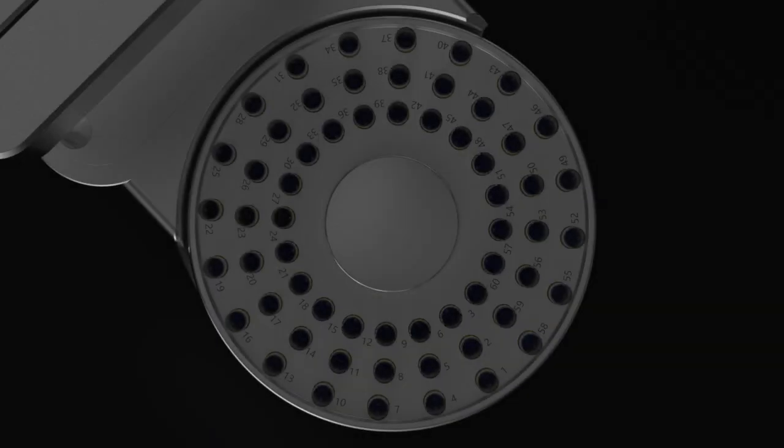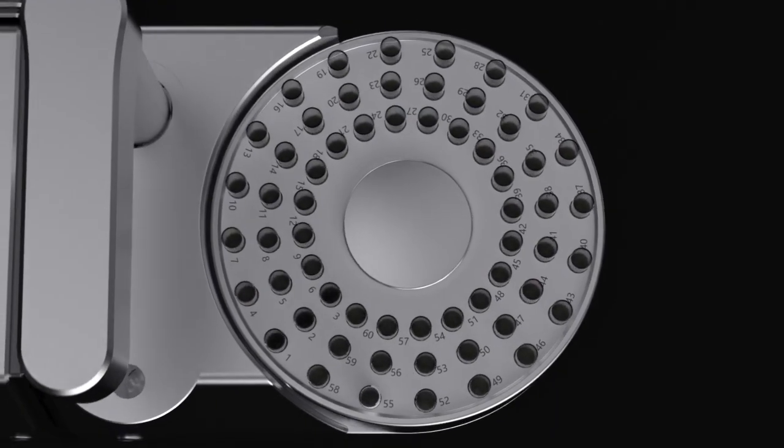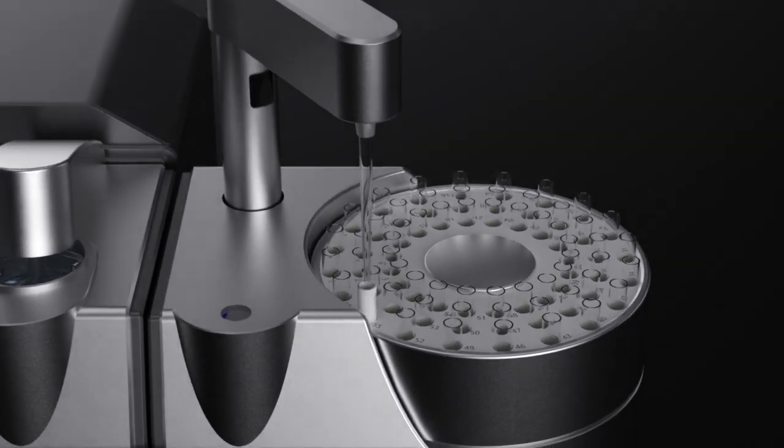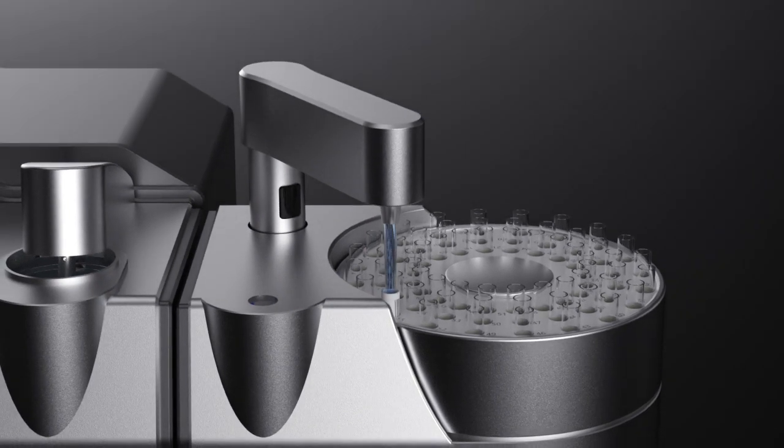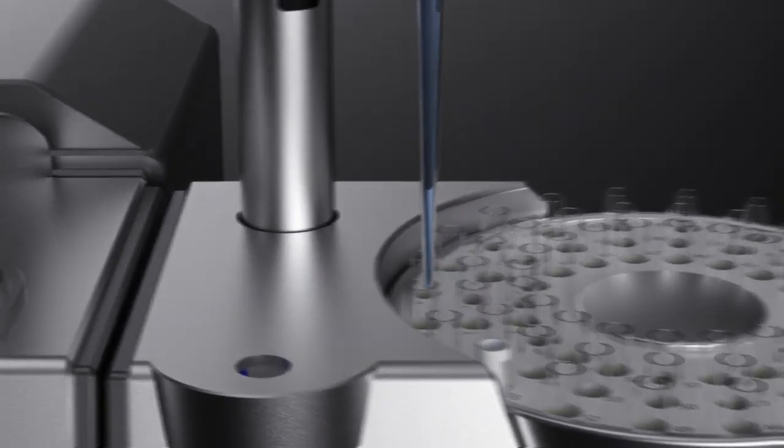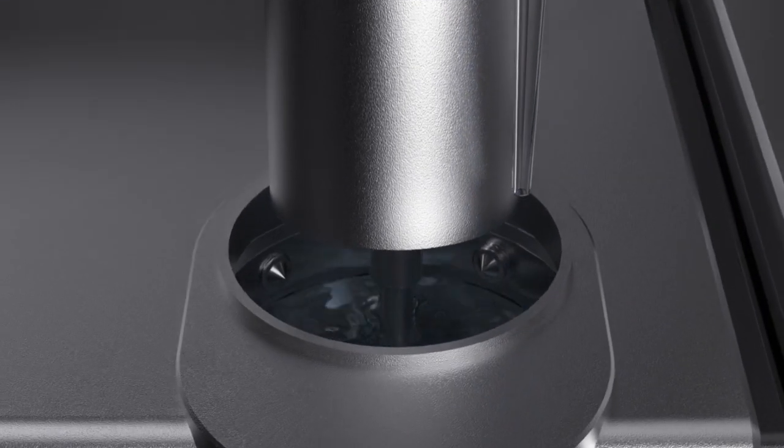This is BT-A60, a brand new auto-sampler that pre-disperses up to 60 samples automatically whether they are dry or wet. But I am getting too ahead of myself. Let me show you something truly amazing.